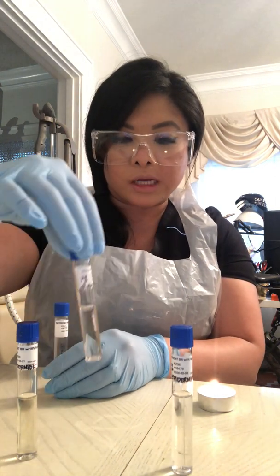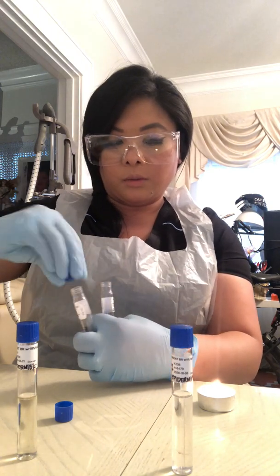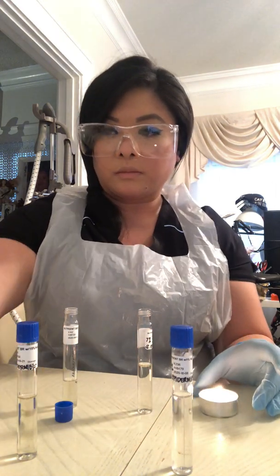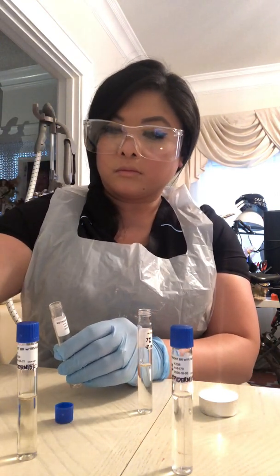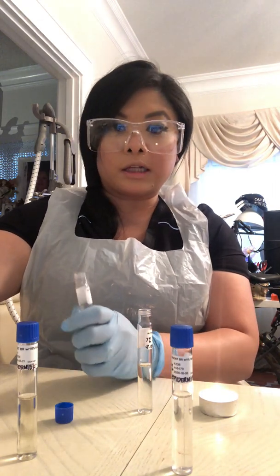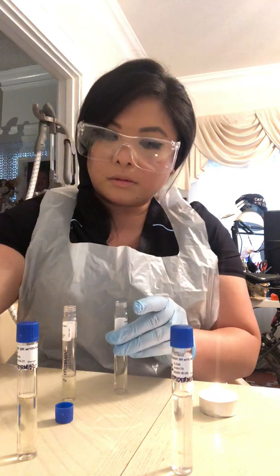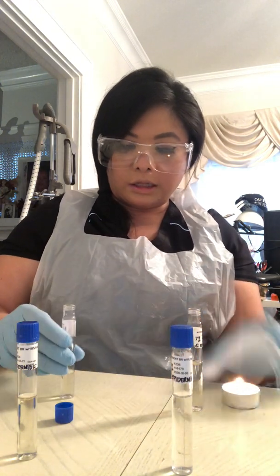Now I'm going to grab my 7% sodium chloride, and I'm going to do the same thing and sterilize both my sodium chloride and my culture broth. And then I'm going to dry my pipette. Then I'm going to collect 2 drops again of the culture and transfer 2 drops. And then sterilize the lids of both, and then recap.